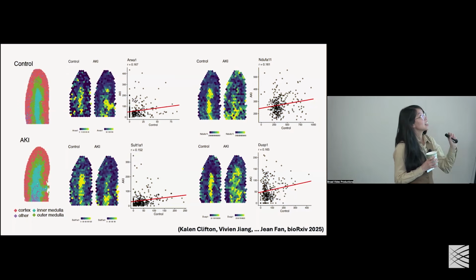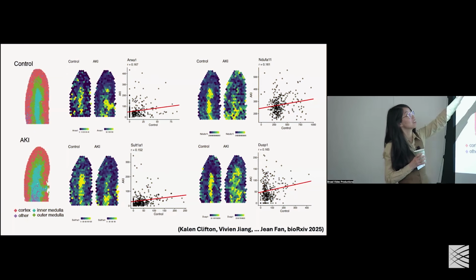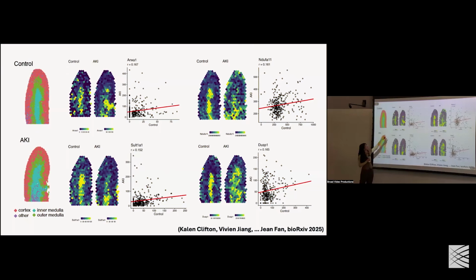I think you can see why: these are autocorrelated programs that, especially in the first example, might be autocorrelated but independent of each other. They're not necessarily medullary or cortical, but they happen to overlap at a sufficient number of locations where the analytical p-value, not accounting for the autocorrelation, thinks there's a significant association.